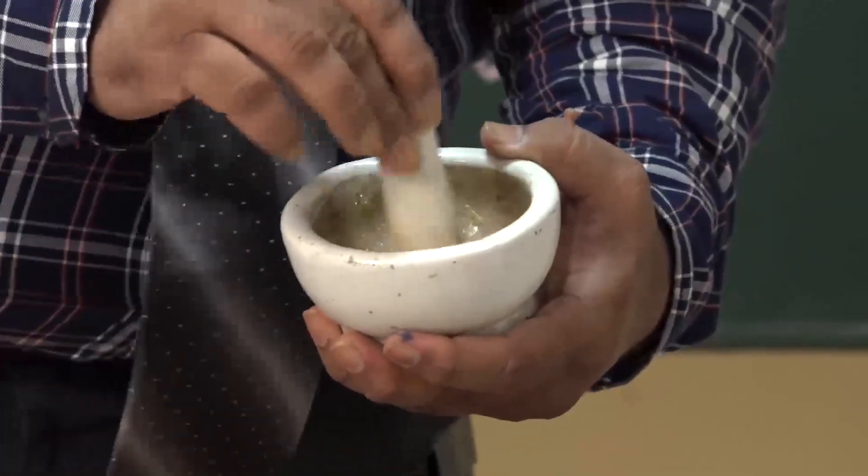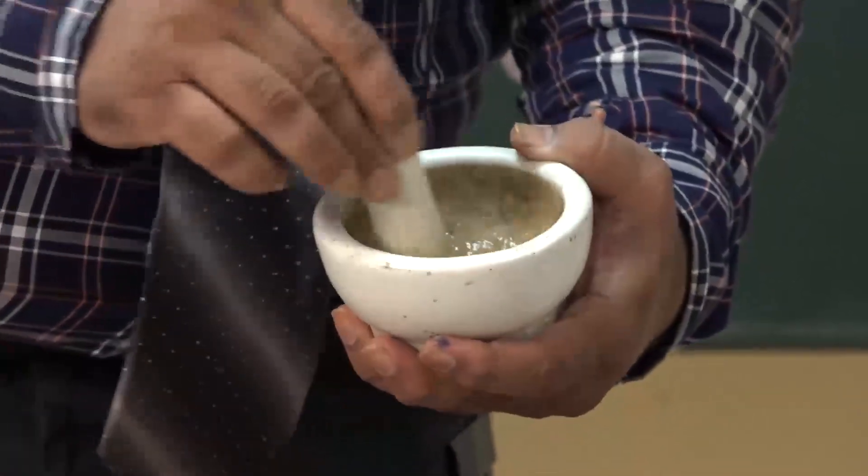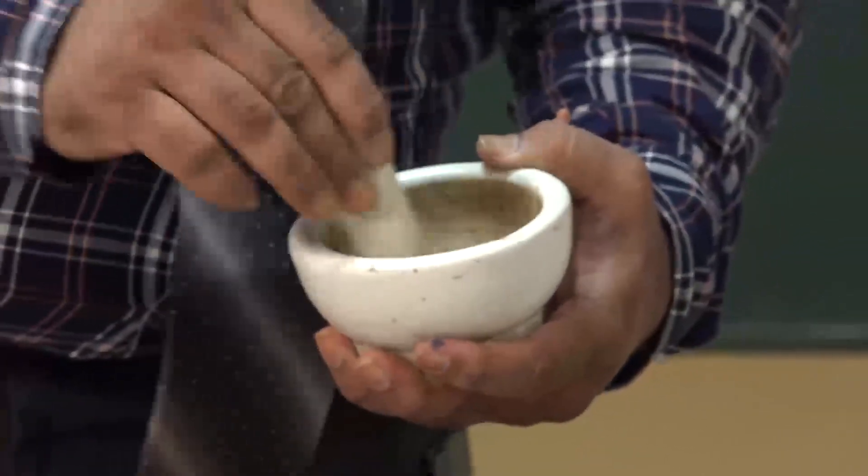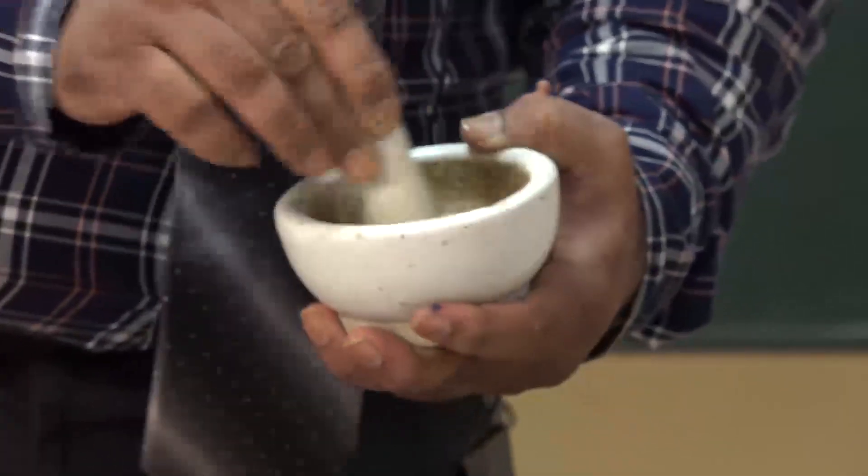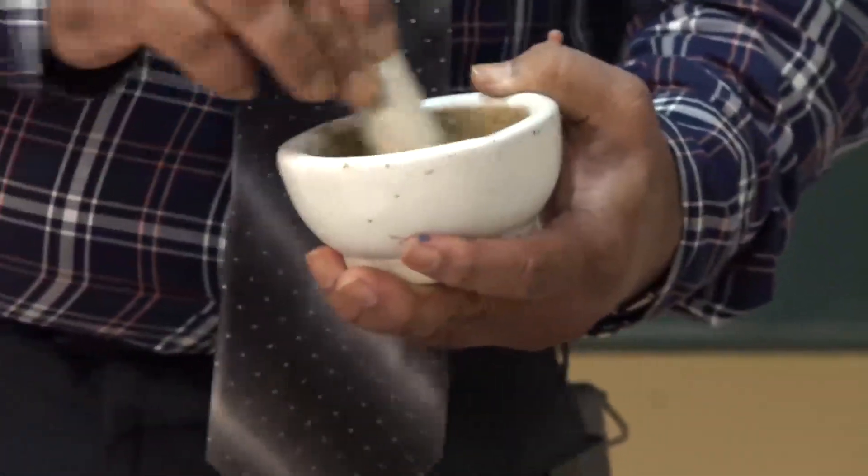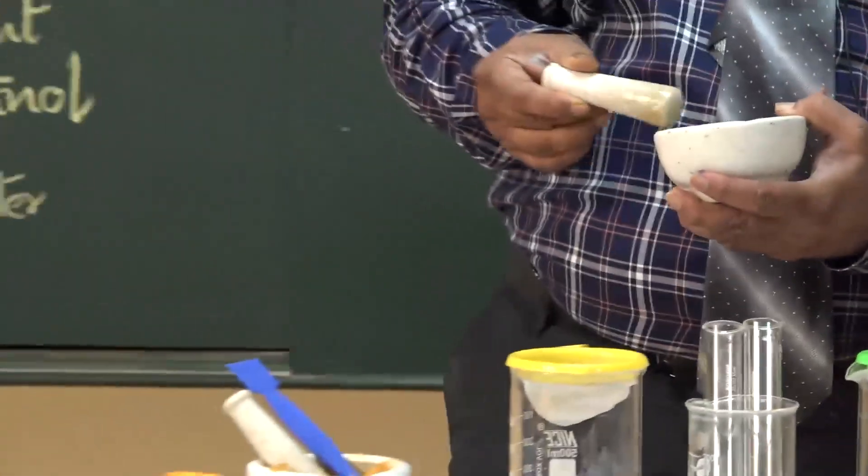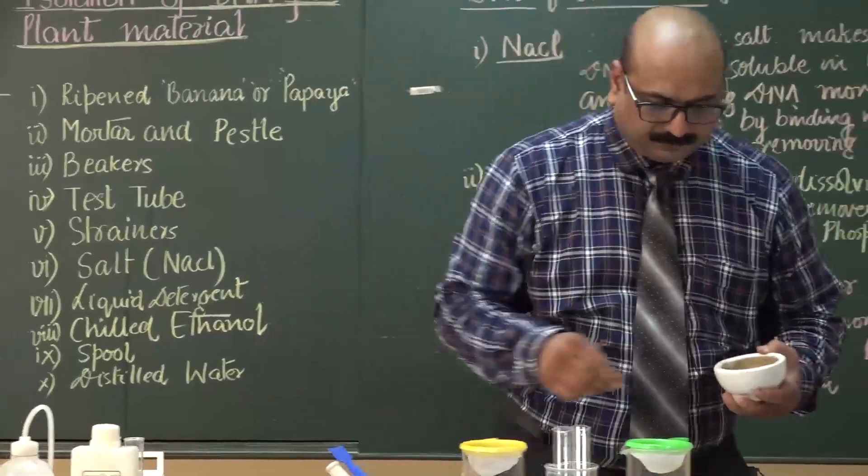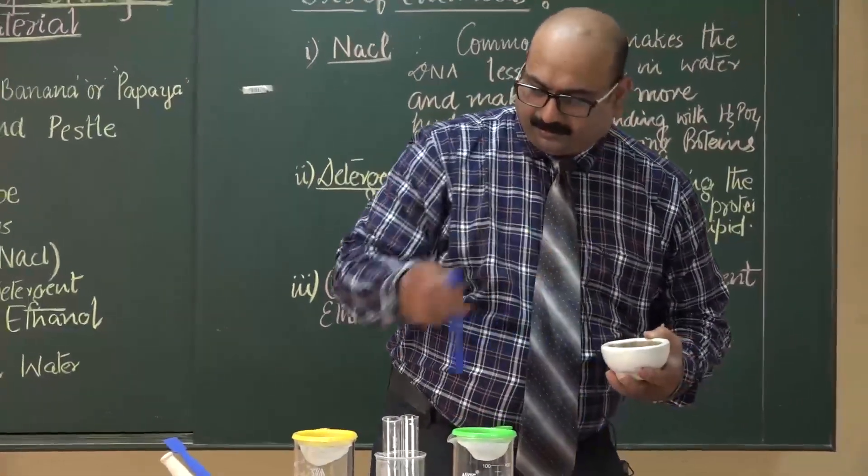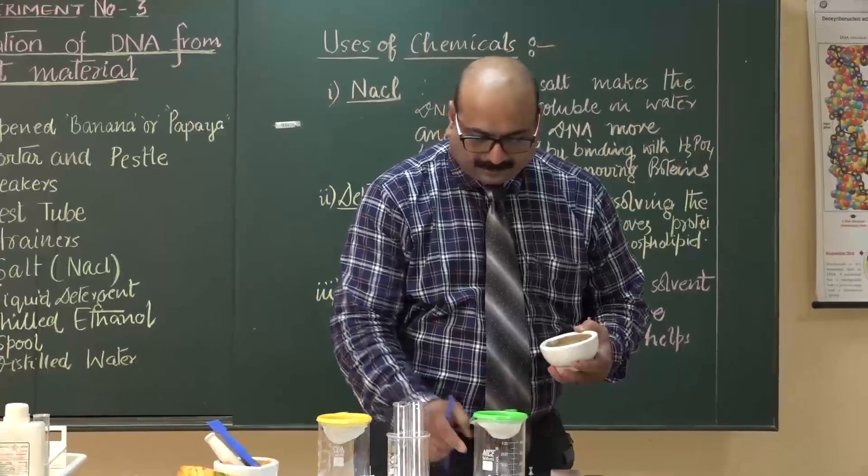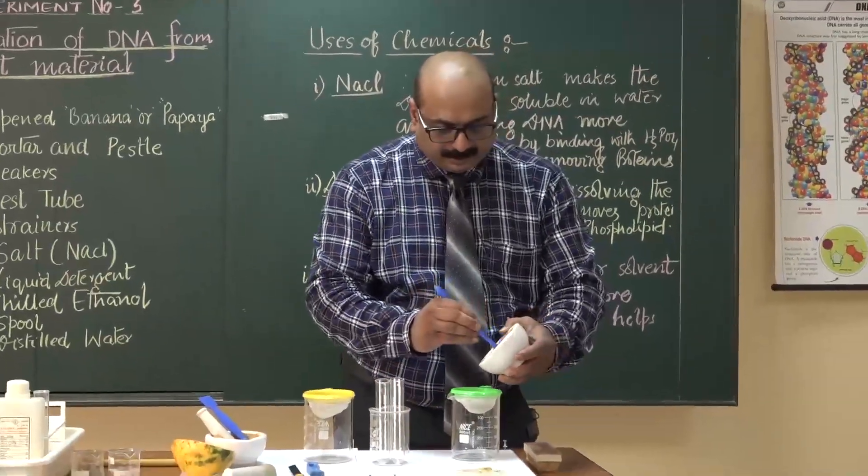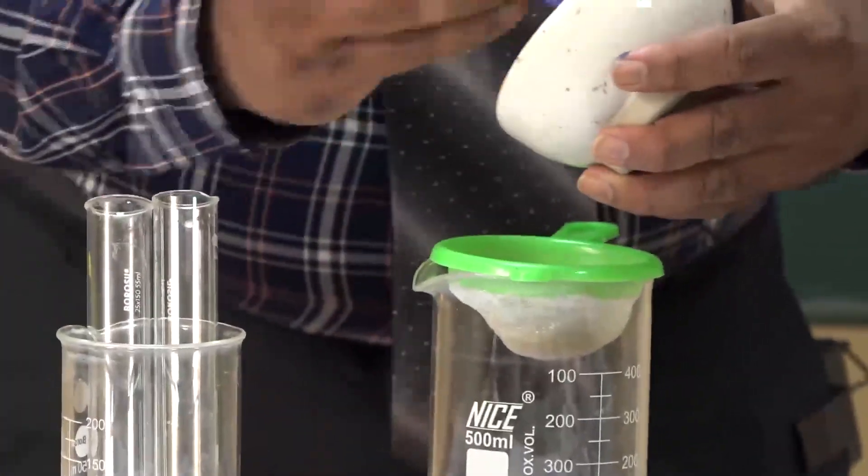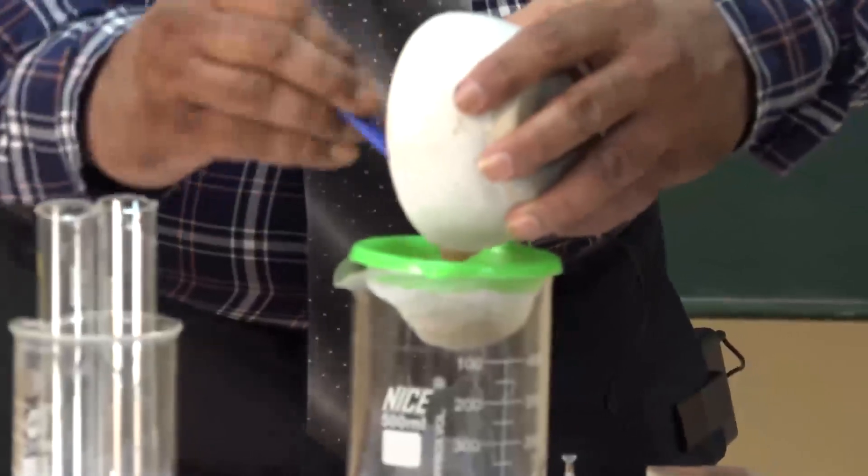So, it was very easy to make paste, it takes less than 4 or 5 minutes. Now it is in a form of slurry. So, it has to be filtered out with the help of this spatula. I am taking out banana paste slurry.